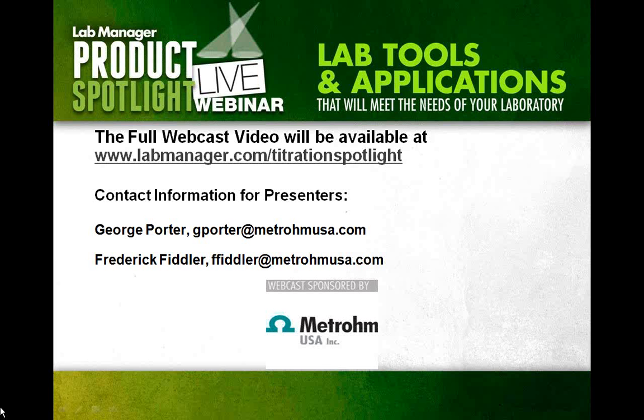If a sample contains both thiocyanate and chloride, could you detect both without one interfering with the other? I'm assuming this is via silver nitrate titration.